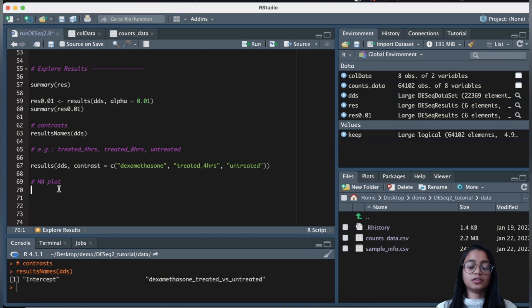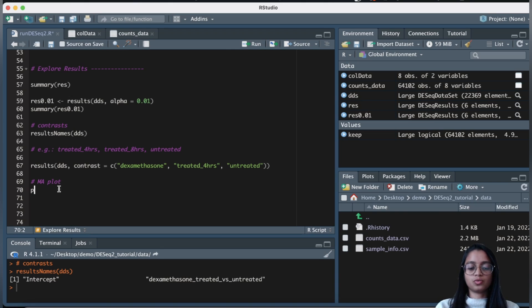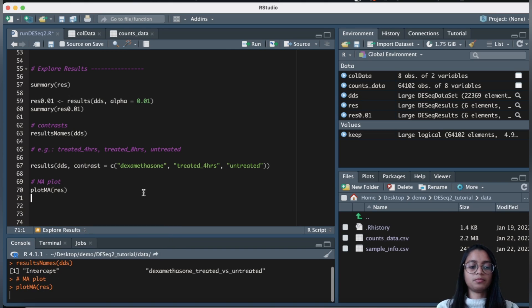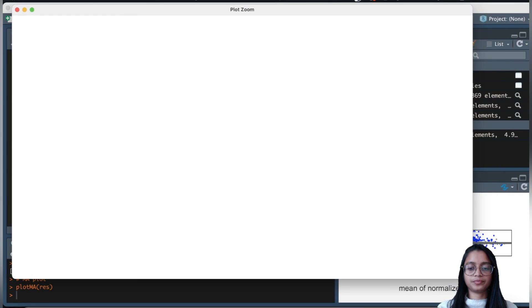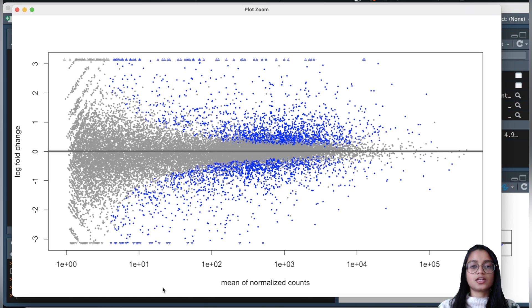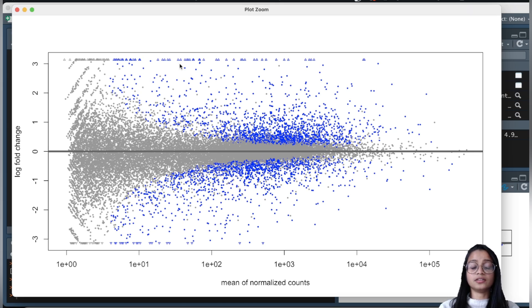Regarding visualization, there are various ways to visualize results, including volcano plots. One plot we can create is an MA plot, using the plotMA function. The MA plot is a scatter plot of log2 fold change versus the mean of the normalized counts. It shows genes that are differentially expressed: genes colored in blue are significantly differentially expressed with adjusted p-values less than 0.05. Smaller triangles at the edge of the plot indicate genes with higher fold changes, and the direction of the triangle indicates the direction of the fold change.